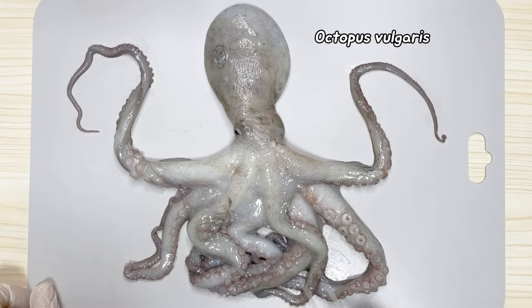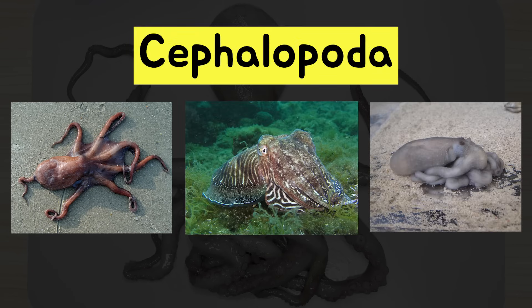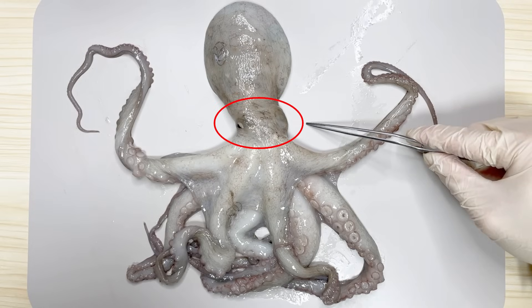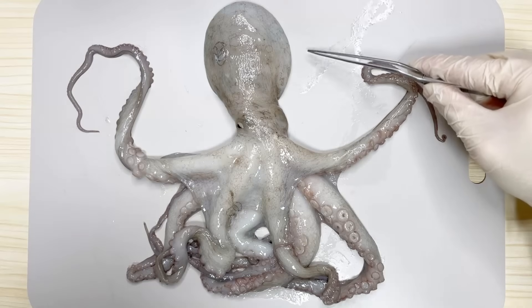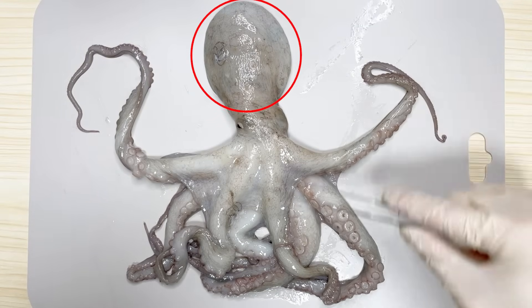This is an octopus. Octopuses, like squids, belong to the class Cephalopoda, which is a type of mollusk. However, in cephalopods, although the entire area looks like a head, to be precise, the head region is the narrow area around the eyes. That's why this part visible underwater is considered the head. The upper part is the body of the octopus, so all the internal organs are located inside this body.